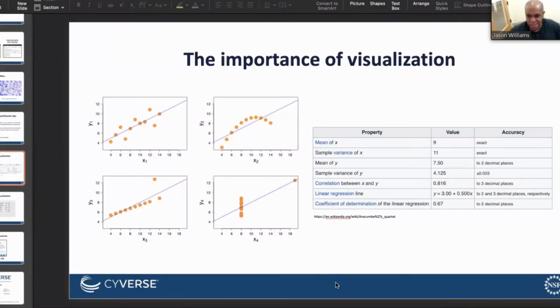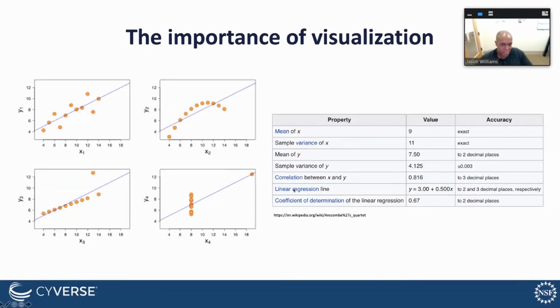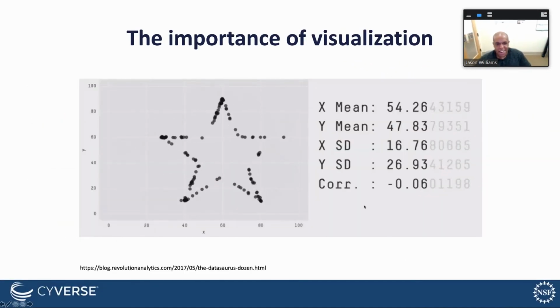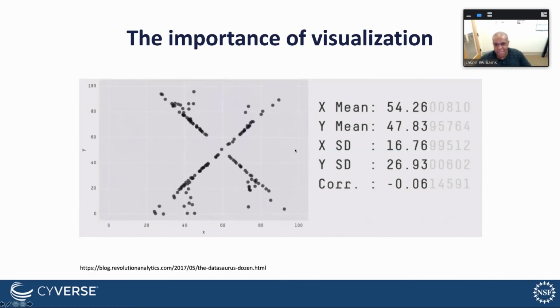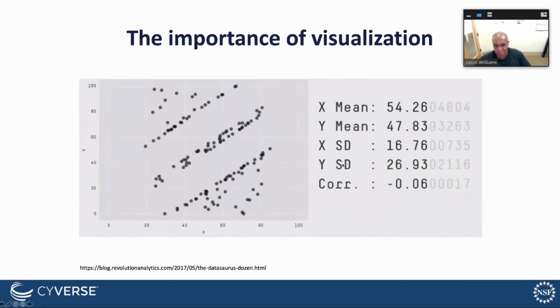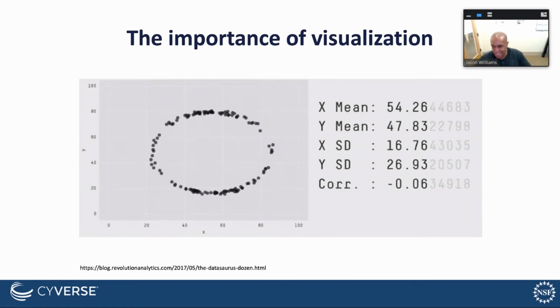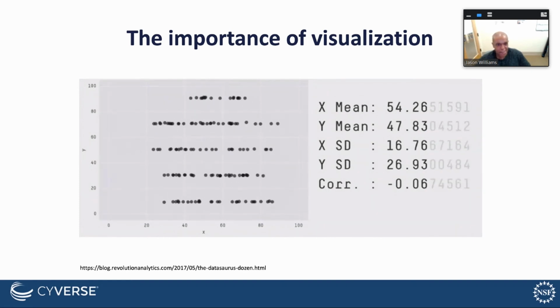So I'm really going to wrap up. Like I said, make sure you visualize those data. I always love this little animation because all of these little graphics have the same mean and standard deviation correlation. So you can make the data do whatever you want if you cherry pick it. So you really have to go in and look to see those patterns.